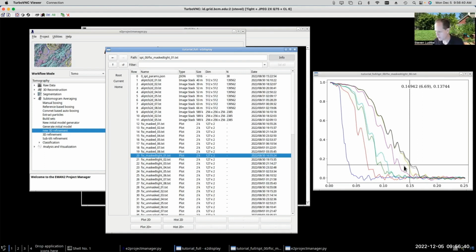Well, usually you'd look at the FSC curve, and if the FSC curve stops getting better, then you assume you've achieved convergence. If you like, you could actually look in those LST files and pull out the alignment parameters and see if they're changing much anymore. But it's not always a great way of judging. If you look at single particle analysis, you find that even once you've converged, individual particles may still be shifting around in their orientations. So convergence is sort of pseudo convergence, not true convergence.